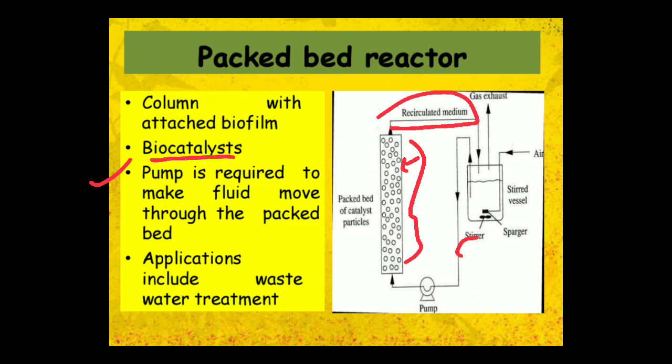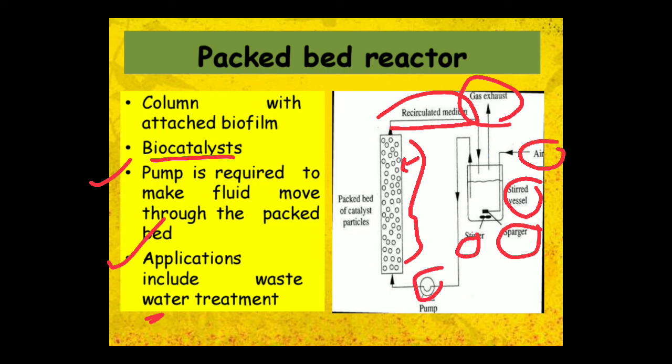This is the stirrer, this is the sparger, this is the stirred vessel. Here you are getting the air supply and the gas exhaust point. It is mainly used in wastewater treatment. This is the pump which is functioning for the whole fermenter reaction.